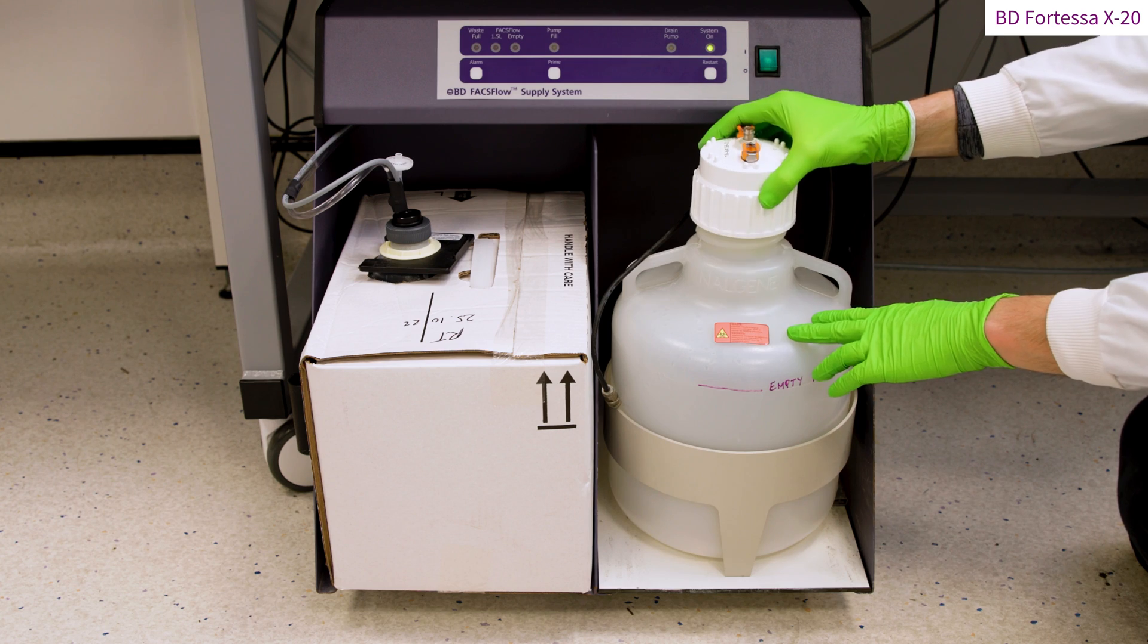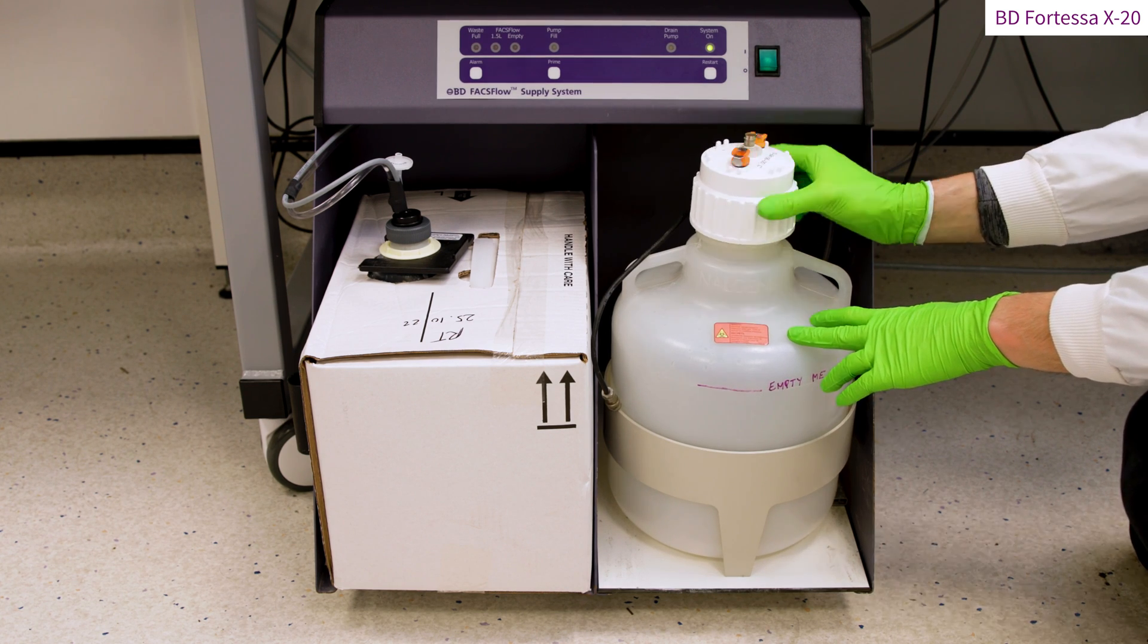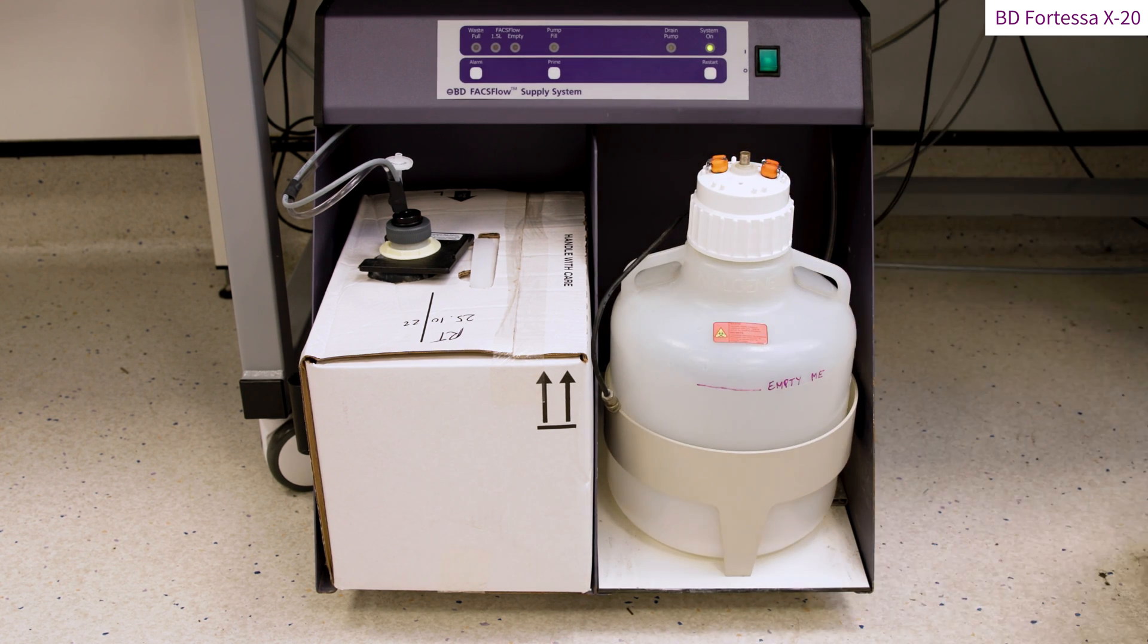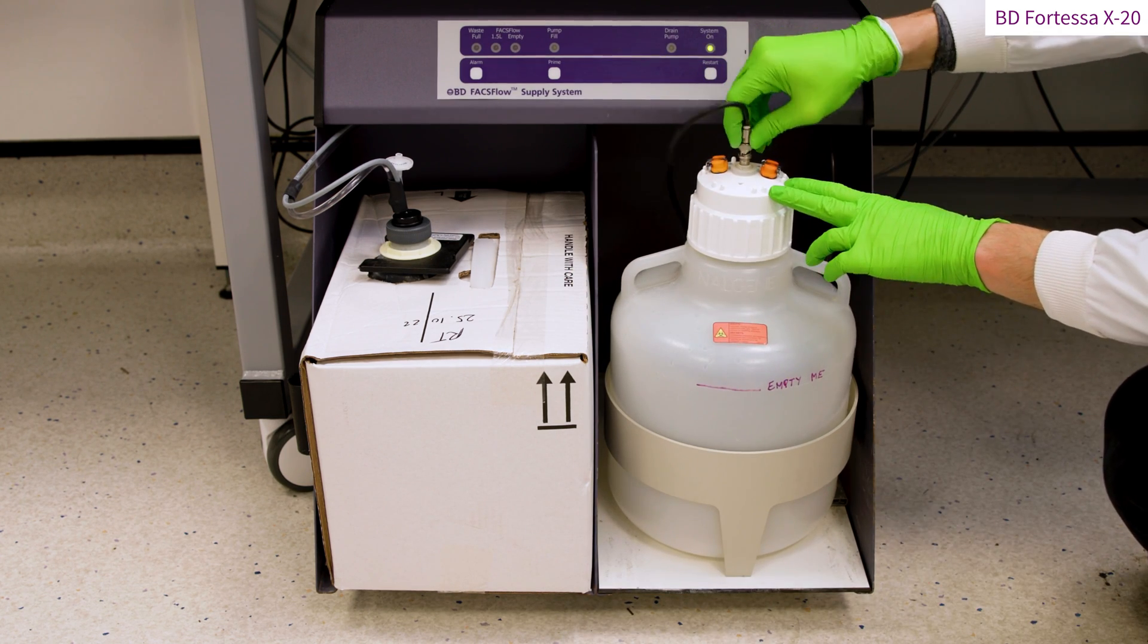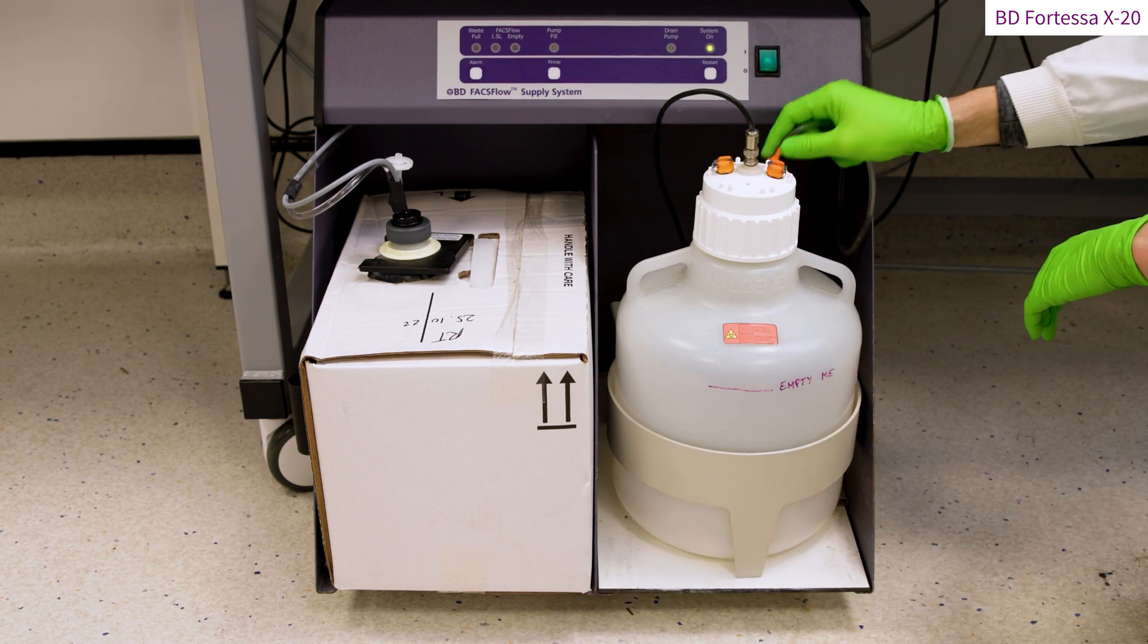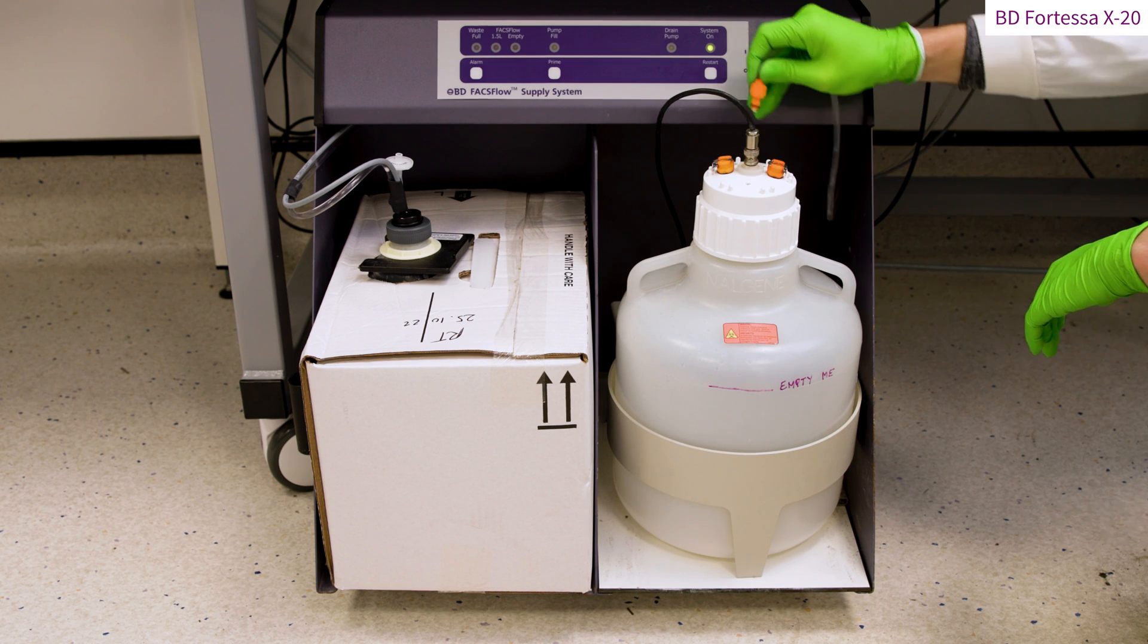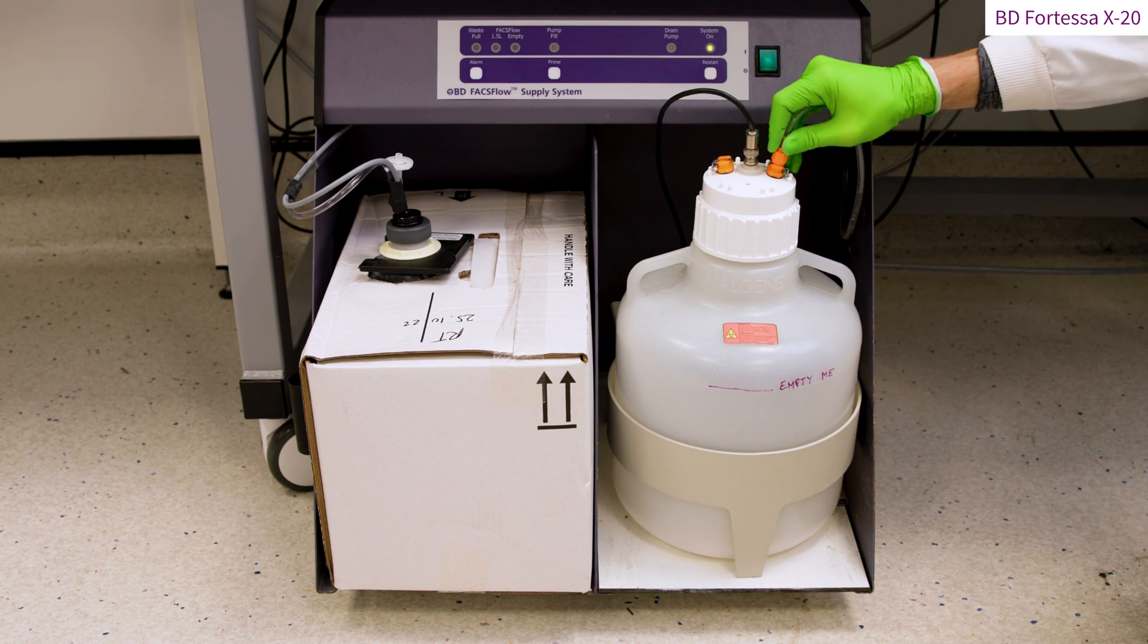To seal the waste tank, place the lid back on and rotate it clockwise. Reconnect the center line by pushing the metallic connector and rotating it clockwise. The orange waste fluidic line can be reconnected to any of the two orange female connectors found on the lid.